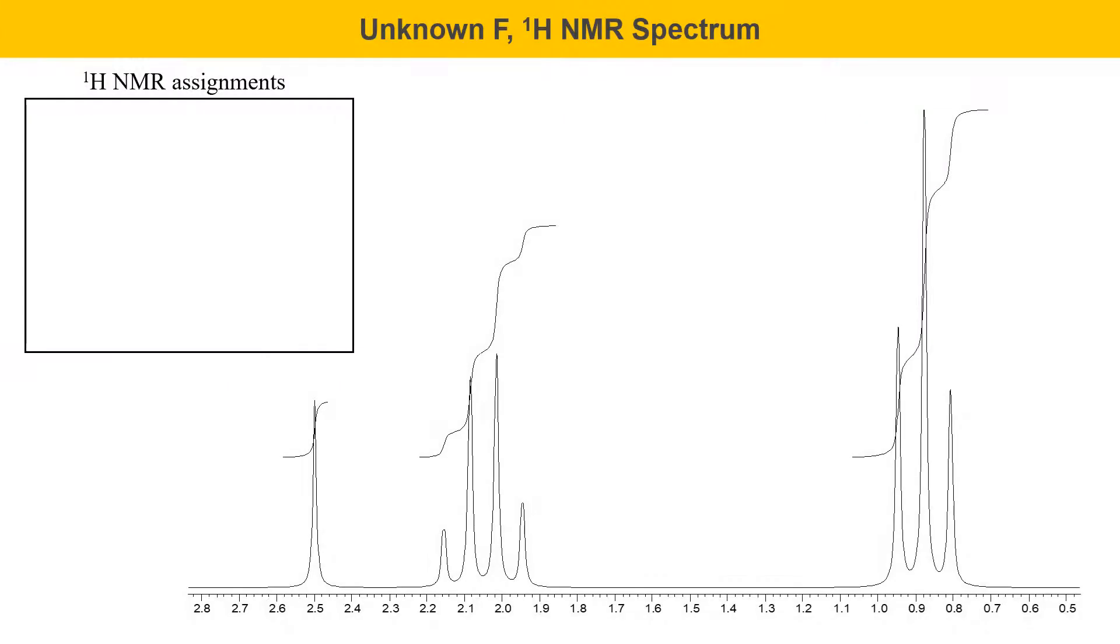Here's the proton NMR spectrum of unknown F. One of the things I want to point out here is this signal at about 2.5 integrates a little low. In other words, when you're trying to develop your ratios of protons, this one will come out a little lower than it should. That's something that happens sometimes. Experimental integrations in NMR peaks are not perfect. And sometimes some peaks end up integrating a little lower than they ought to. So just be aware of that.